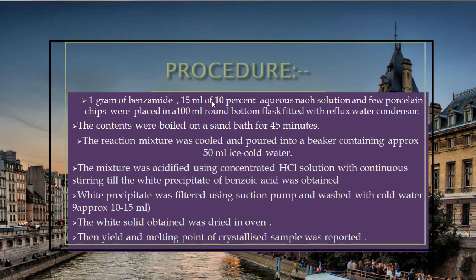The contents were boiled on a sand bath for 45 minutes. The sand bath allows uniform heating of the solution. The reaction mixture was then cooled and poured into a beaker containing approximately 50 milliliter of ice cold water.